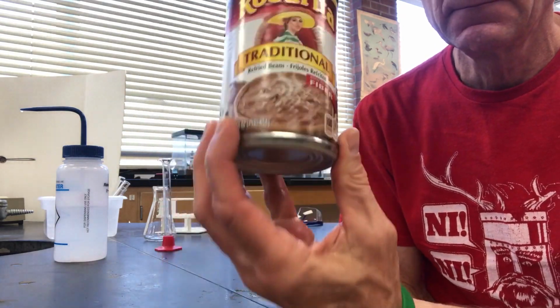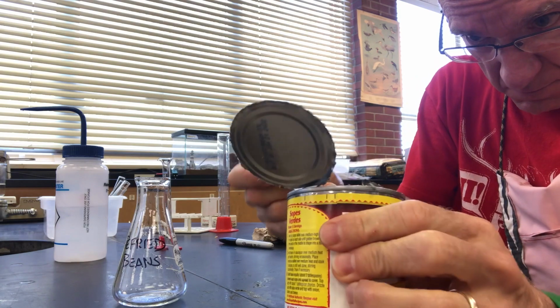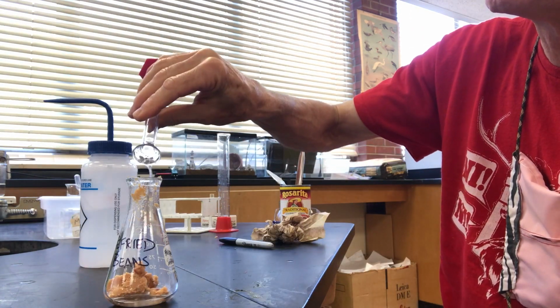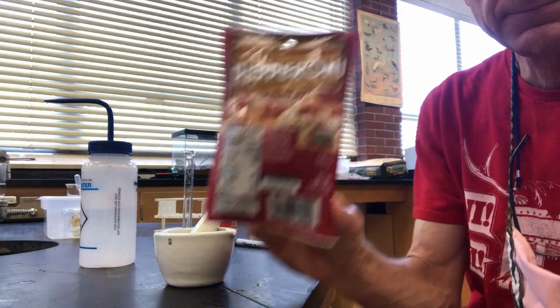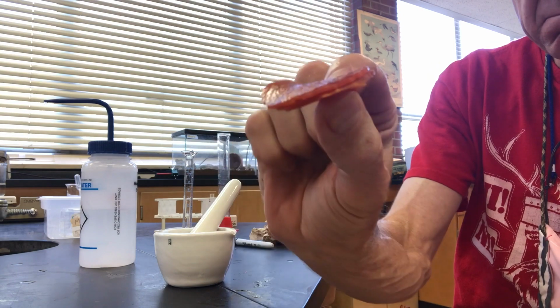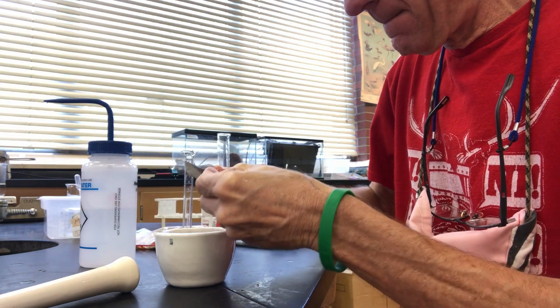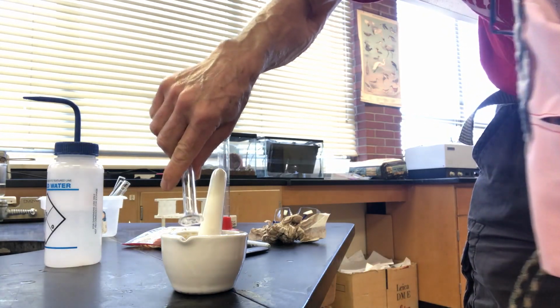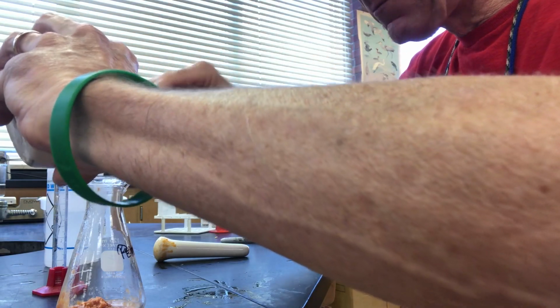Preparing the refried bean solution requires opening the can of beans, then scooping out a small quantity into a labeled flask, adding 10 milliliters of water, and mixing them thoroughly. Finally, for the pepperoni solution, remove 2 slices of pepperoni and cut them into small pieces into the clean mortar. Mash thoroughly with the mortar and pestle. Then add 10 milliliters of water and continue to mash with the mortar and pestle. Transfer the thick pepperoni soup to a labeled flask.